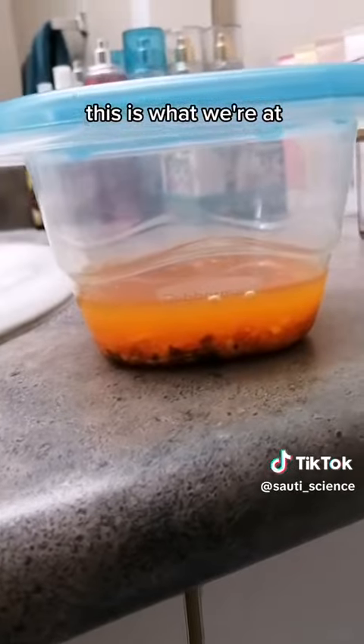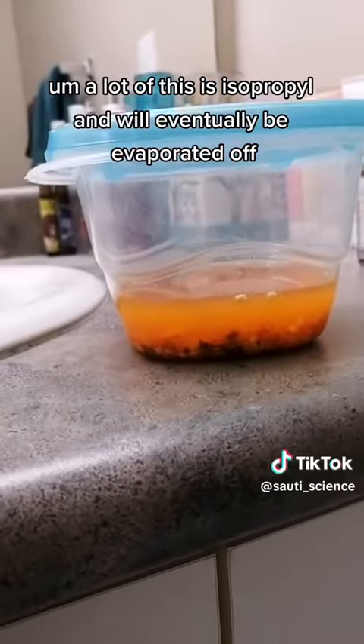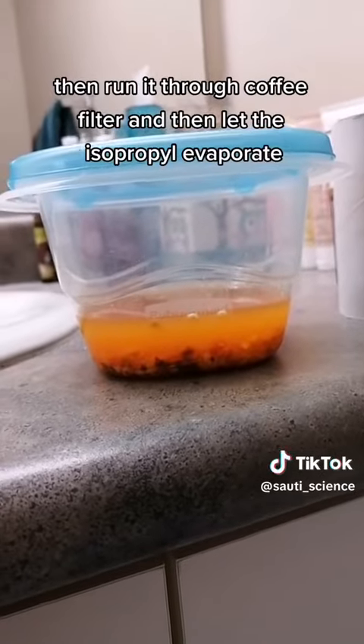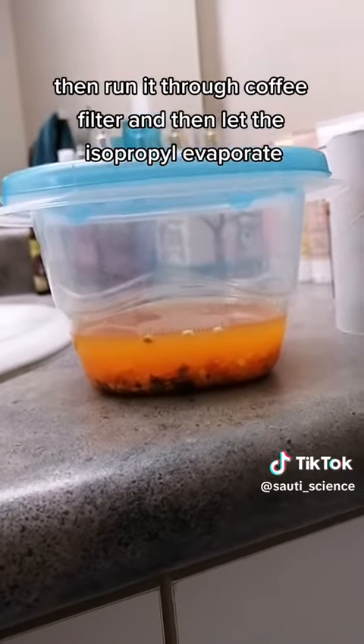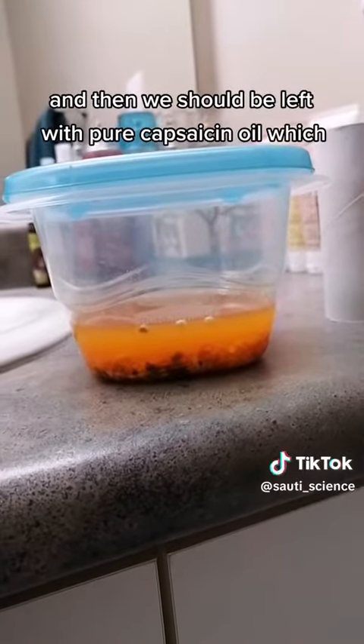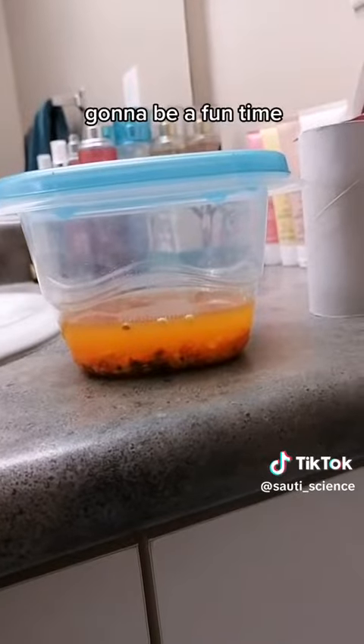This is what we're at — a lot of this is isopropyl and will eventually be evaporated off. I'm gonna leave this to steep for a couple days, then run it through a coffee filter, and then let the isopropyl evaporate. And then we should be left with pure capsaicin oil, which is gonna be a fun time.